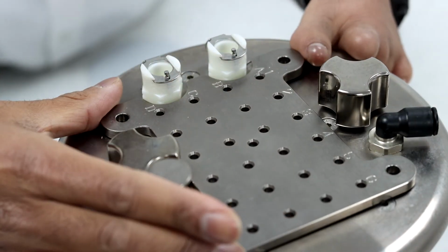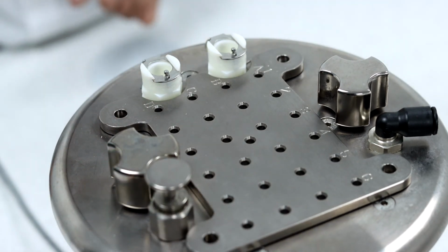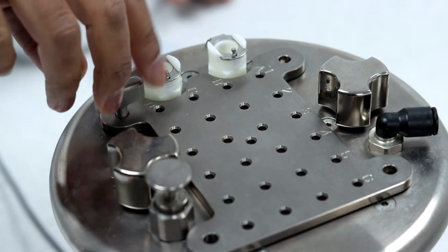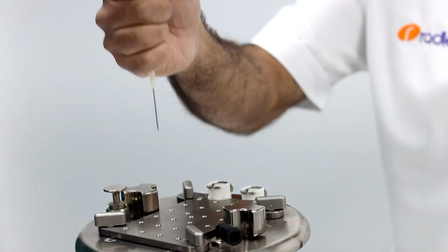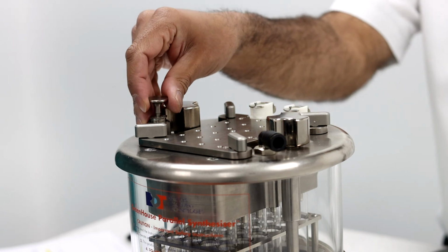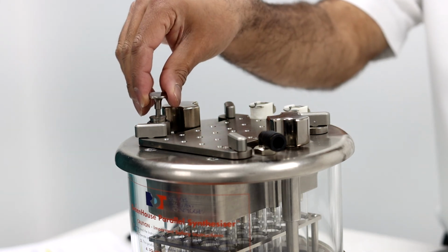Before making your reagent additions, it is important to relieve any pressure from within the chamber, otherwise you might not be able to inject your reagent or there may be splashback through the head. To do this, fully lift the relief valve to remove excess overpressure before you start.